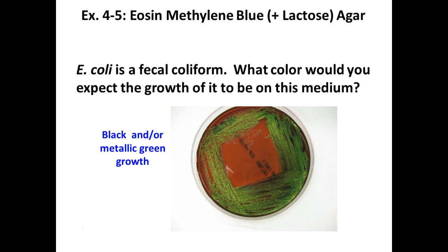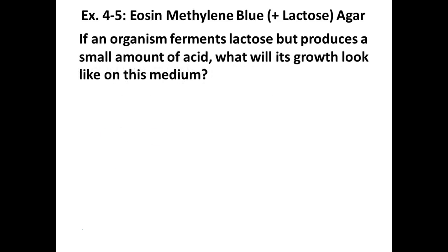It's out there. I know it is. I saw one. Now, you guys, back table? Not yours, is it? No, I know what yours was. Maybe it's still here. Maybe I'm hallucinating. I'll find it and show you guys. It's around somewhere. My control plate, unfortunately, it didn't stay.